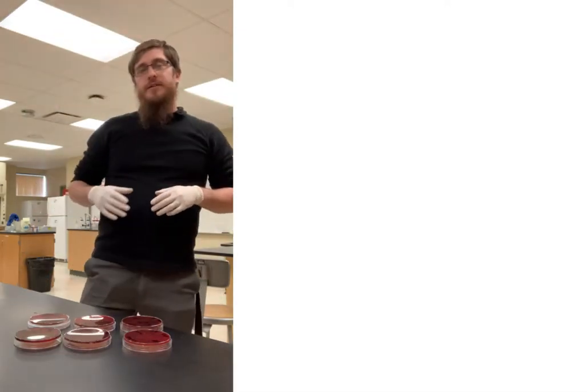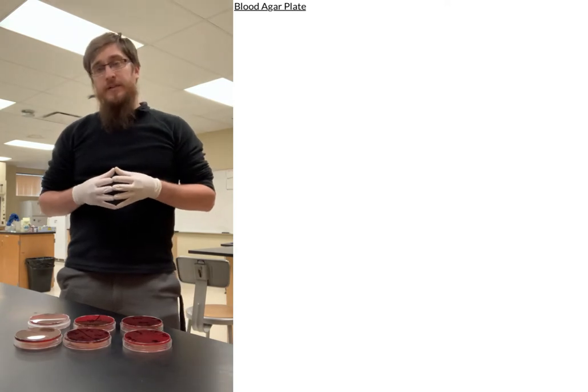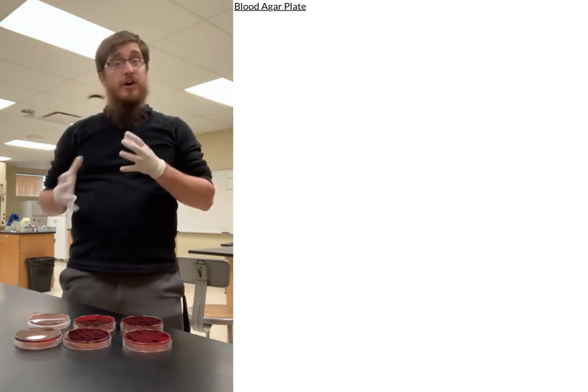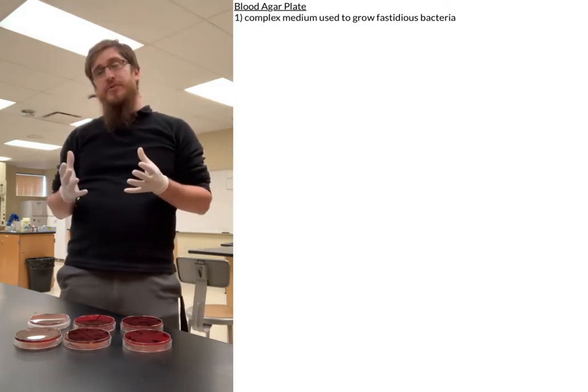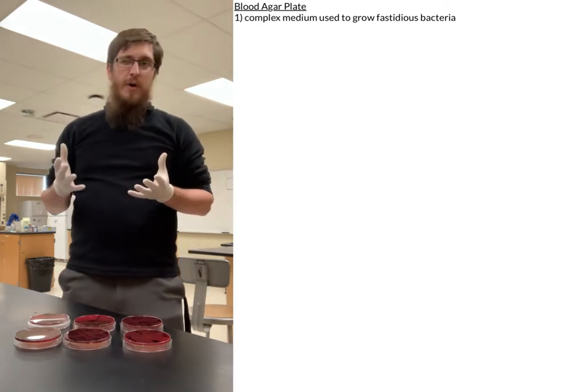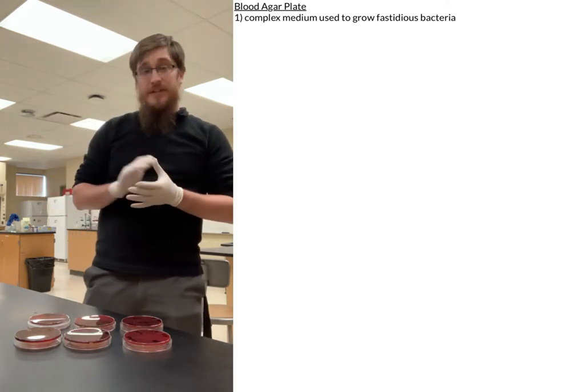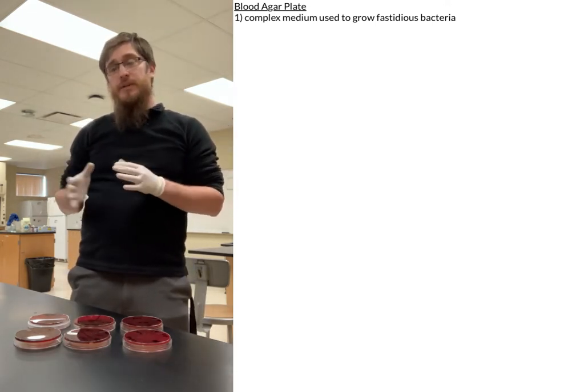Hey everybody! Today we're going to be talking about the blood agar medium. The blood agar medium is a complex medium that is generally used to grow fastidious bacteria, or bacteria that require complex or particular nutritional requirements. And that's one reason for this type of plate.